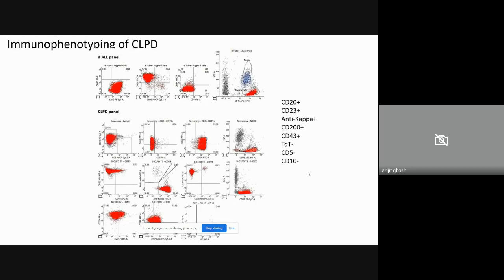I will not elongate. So, what are the advantages? Advantages are that flow cytometry is a very less time consuming process. Suppose when you are doing Western blot, it may take 1 or 2 days, but in flow cytometry it may take only 1 to 2 hours. So there you are also checking the expression of some proteins. So it is very less time consuming.